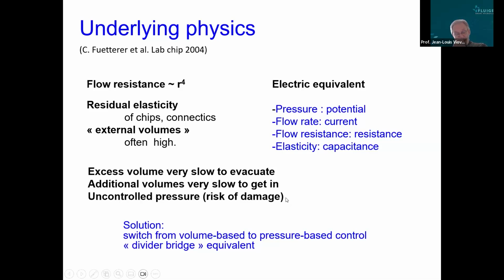And we found that, in general, in electricity, people prefer to do control of current by potential rather than control of a system by current. And this typically gives better time constant and more simple control.